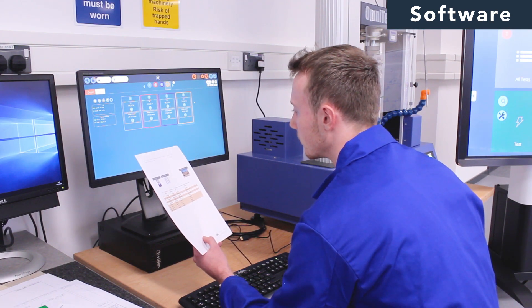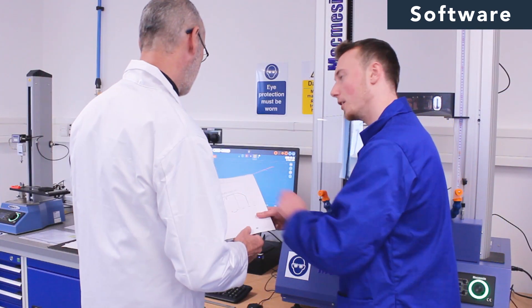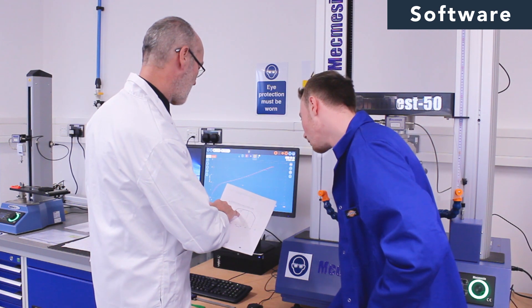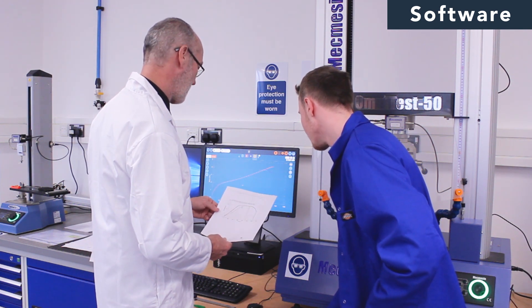Vector Pro MT delivers all the power and flexibility for complete control of your tests and presents the data in exactly the way that you, your operators and your customers fully understand.